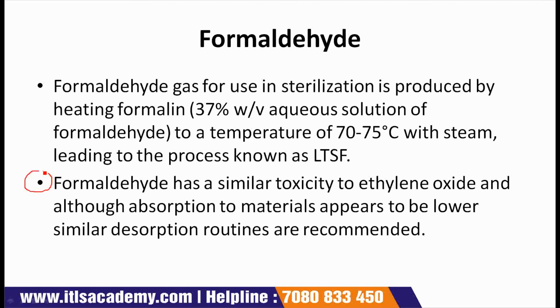Next point, formaldehyde has a similar toxicity to ethylene oxide. Toxicity level of formaldehyde is similar to ethylene oxide that we have discussed in our previous lecture.